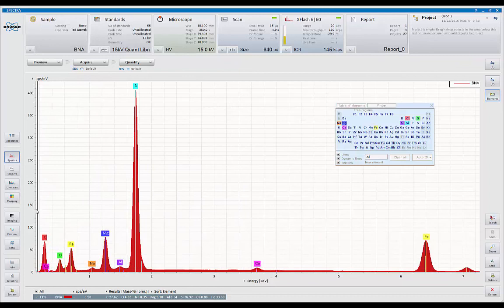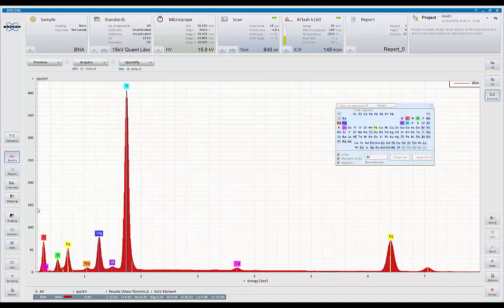So spectrum acquisition is your main control. From this, you may want to go into one of the other controls, such as object mode if you're seeing a lot of variations and want to document it with images, line profile to show subtle differences, or the ultimate is to do X-ray mapping. And these will each be handled by a separate movie.